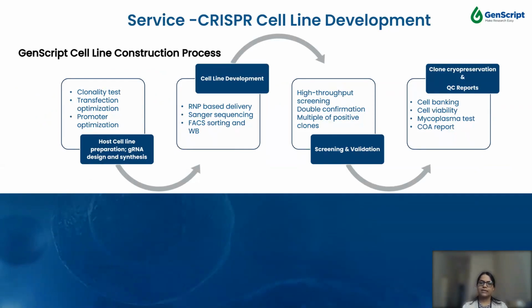In the field of cell and gene therapy, CRISPR knockout and knock-in cell lines are an easy and efficient tool for target discovery, drug screening, disease biology study, or signaling pathway study. And generating an effective CRISPR-mediated gene knock-in or knockout cell line involves a substantial workload.